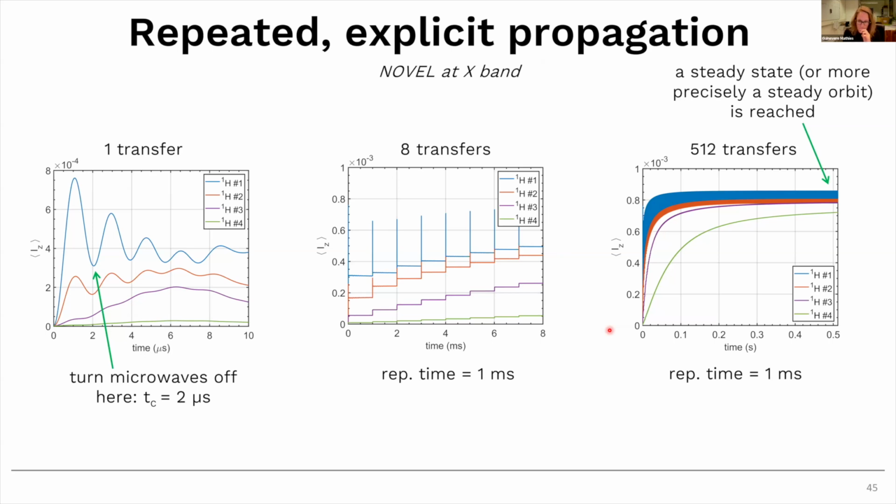So this is what we also see: the build-up time, if your sequence allows it, so it depends on the sequence, but if your sequence allows it, your bulk build-up time becomes faster when you repeat the sequence faster, which is also what you're expecting, right? If you're more vigorously pumping, you will reach that high enhancement faster. So you just create the contact between the electron and the protons more often, and that will speed up your bulk. Yeah. So there's probably some optimum somewhere, and it depends on the sequence that you're using. But that is what we see.